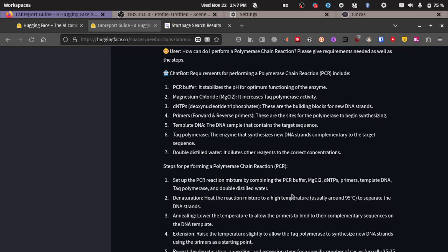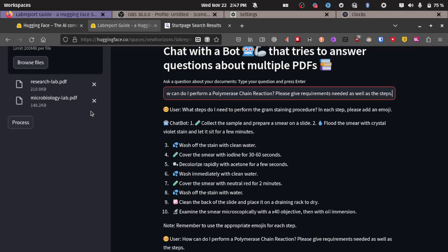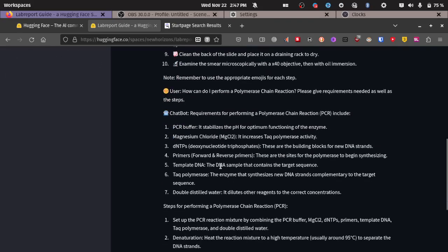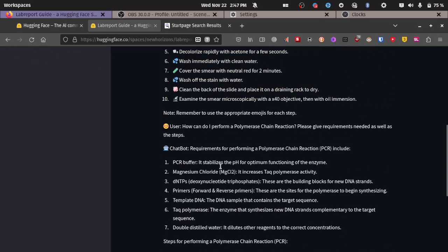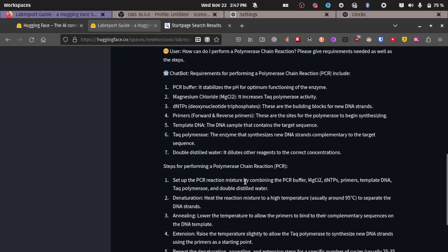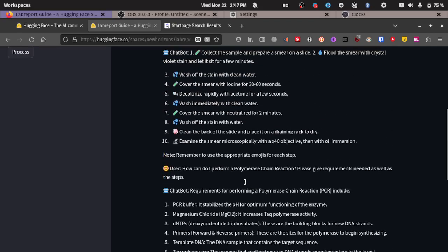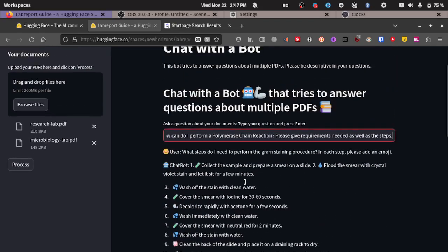With this technique for grabbing relevant information from these documents, you can think of it like a search engine. If there are any mistakes in the document, they're probably going to propagate here too. So I'd advise you to write your protocols really well. Otherwise, this is the application.